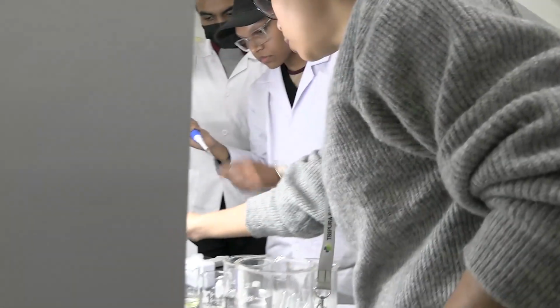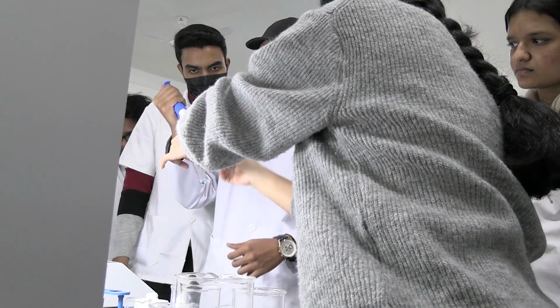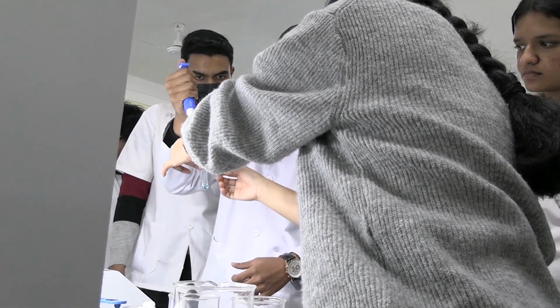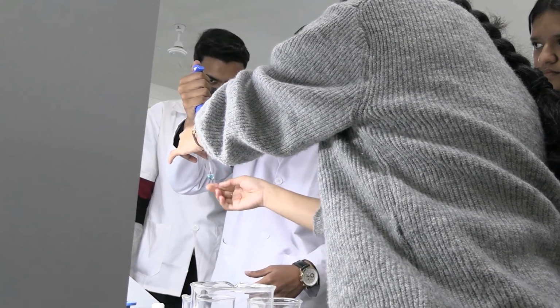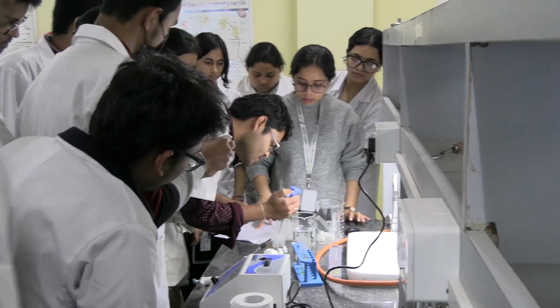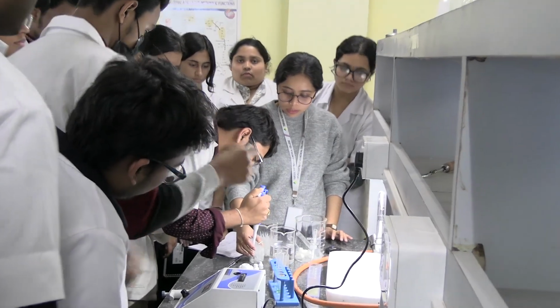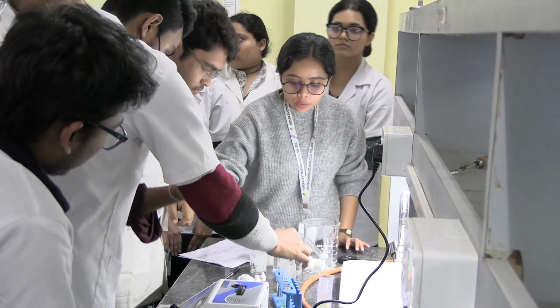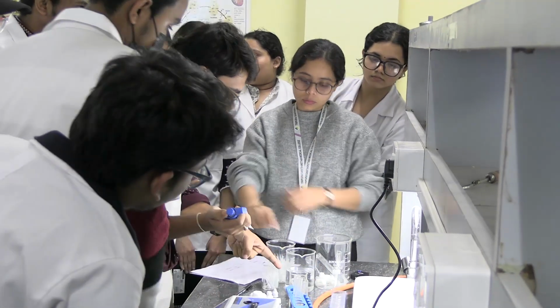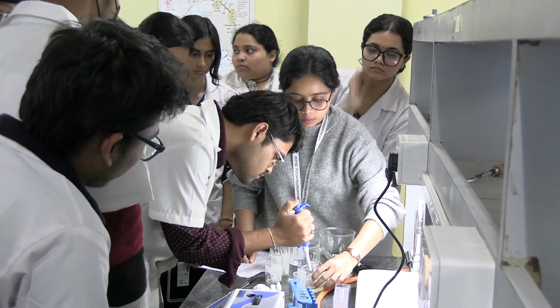One thing. Where is the test tube? Here. How will you put it? Very minutely. Put this one down very minutely. Go down. Yeah, release it now. Release it. Did you see the amount? After your test is done, okay, done. Then we want to take this one or this one? This one. This one, okay. Take. What is done, keep the attendance and everything.